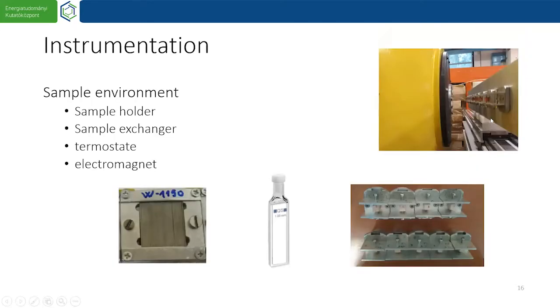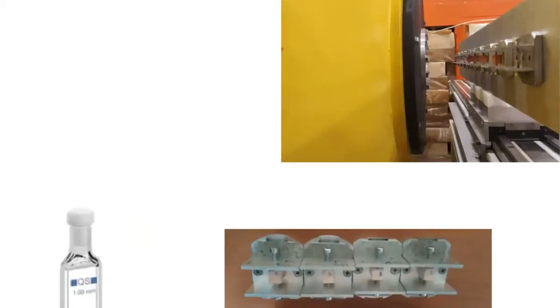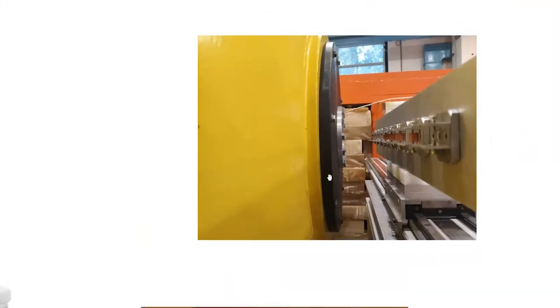Now the sample changer. Here we have a photo of the sample changer, and maybe it's better to show it like this. Basically, it's a small moving car with horizontal movements, and the samples are just put or adjusted in a linear way.